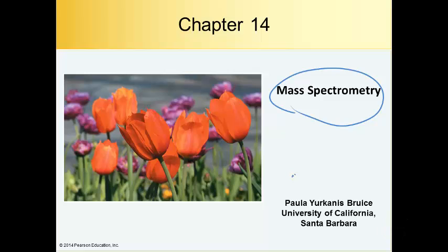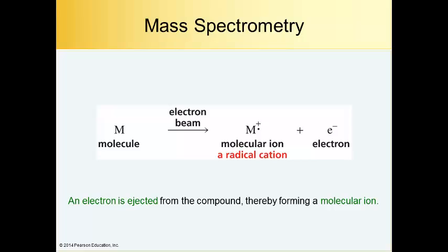Welcome to the video on mass spectrometry. Mass spectrometry is a technique that we can use to explore the structure of organic molecules. What happens is we take any given organic molecule and we hit it with a high energy electron beam.